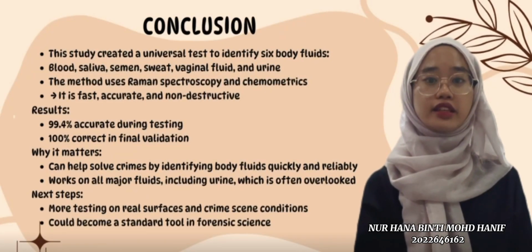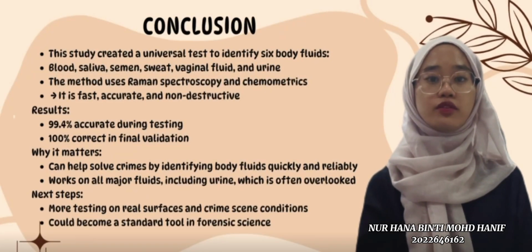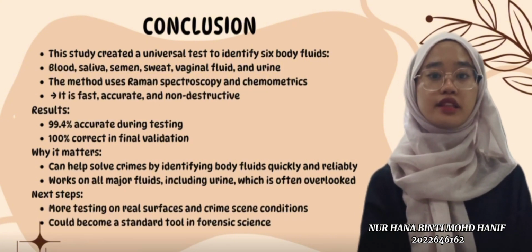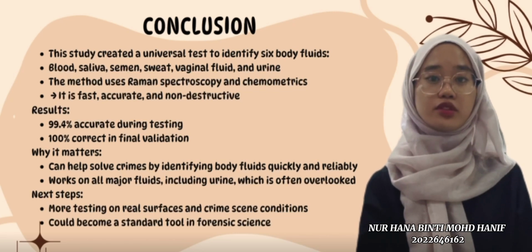In conclusion, this study created a universal test to identify 6 body fluids. It shows 99.4% accuracy during testing and 100% correct in final validation. This helps solve crimes by identifying body fluids quickly and reliably.